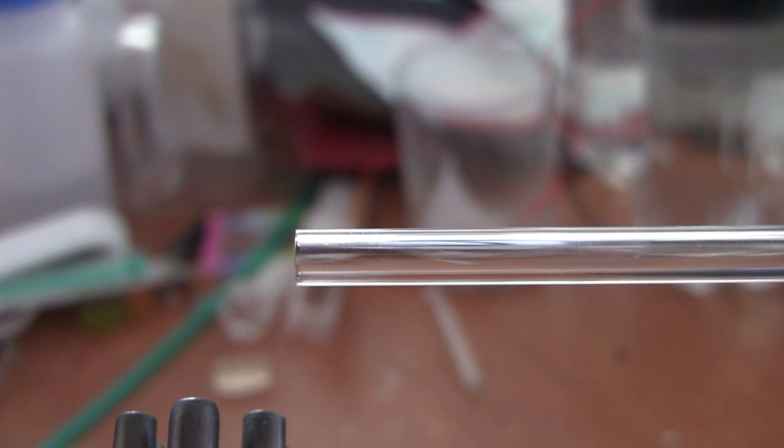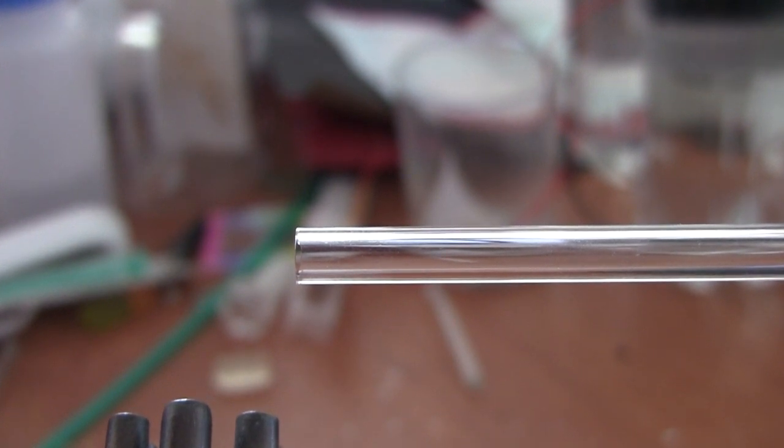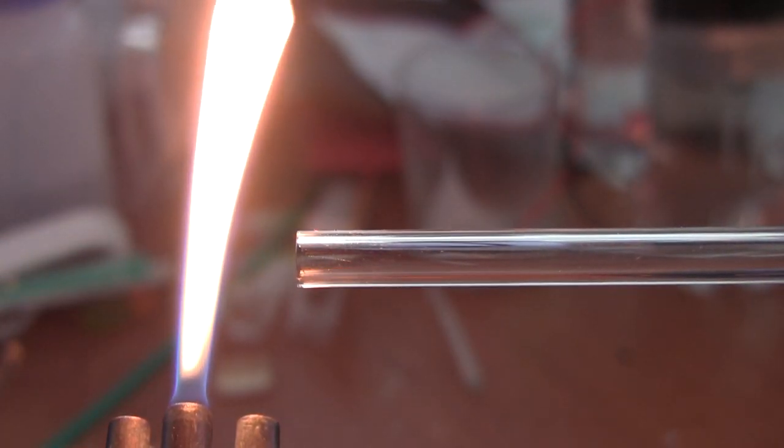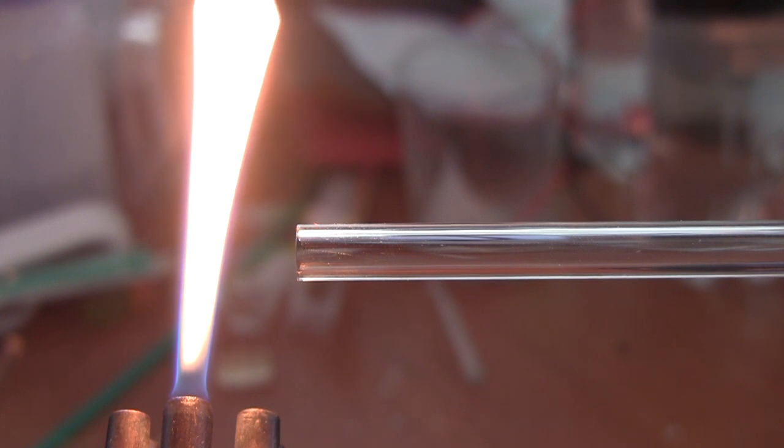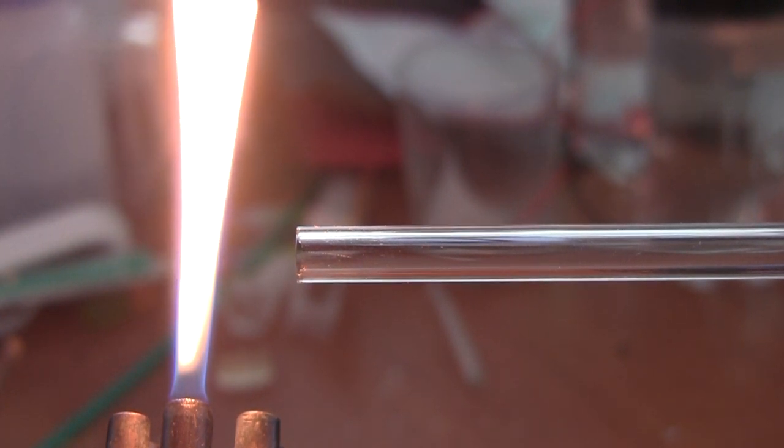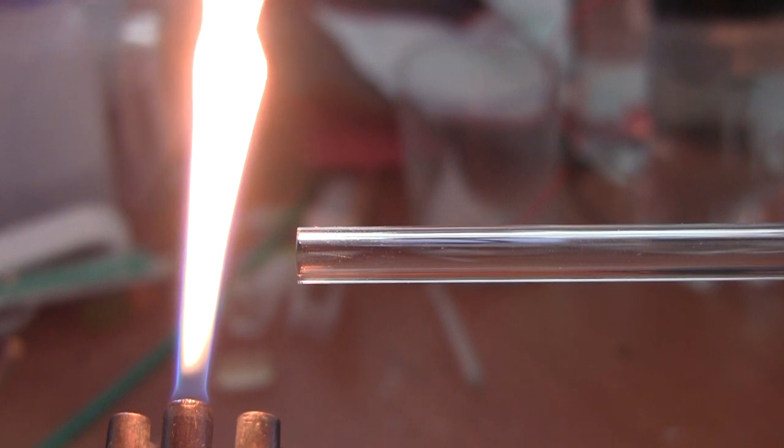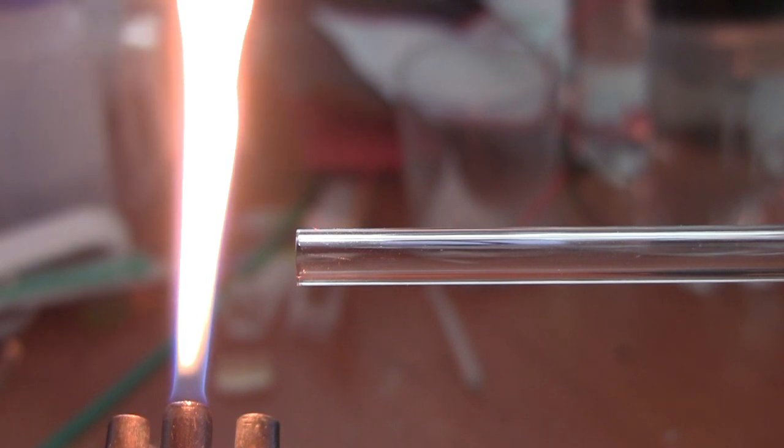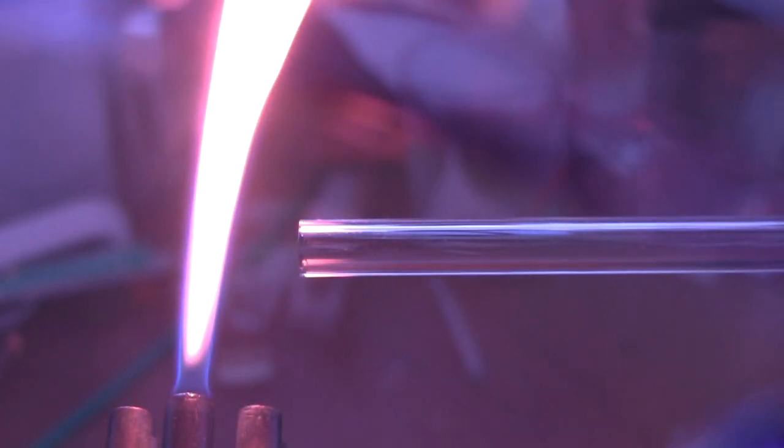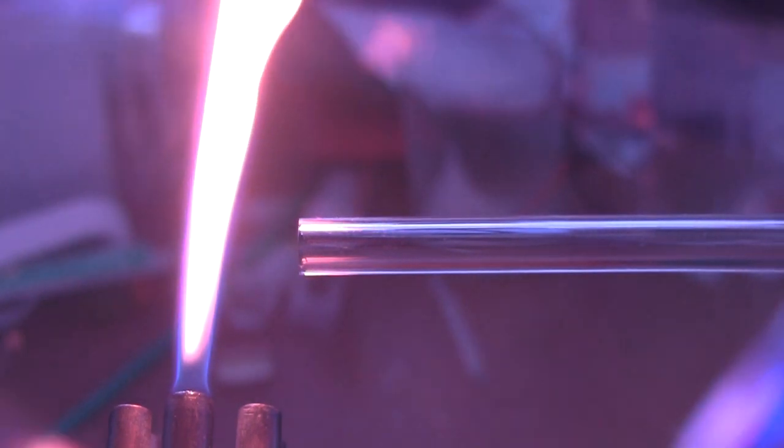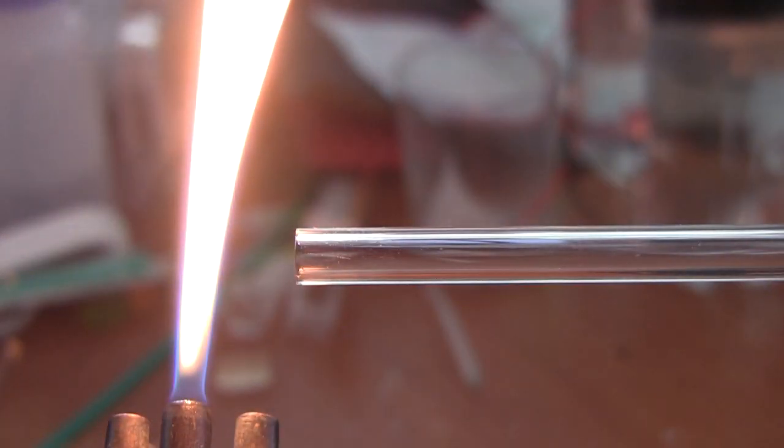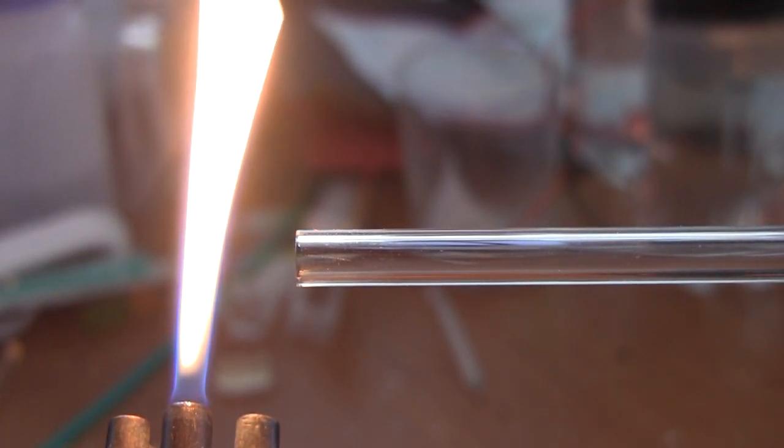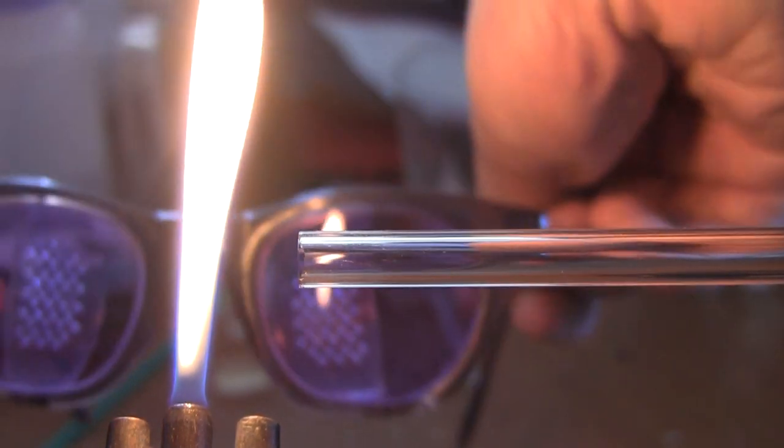So what I'm going to do for starters is I'm just going to kill the oxygen and turn the gas on. There we go. So we've got a sooty flame there, and I'm going to show you some glassblowing glasses. These are glassblowing glasses, these things here. And if I put them over the lens you will see they don't really seem to make that much difference. And they don't, it's true. They let through an awful lot of light. But they do do one interesting thing. I've got two sets of glasses here.